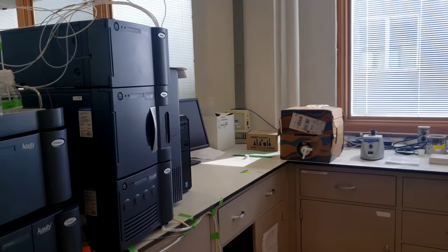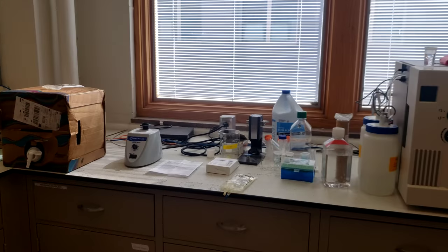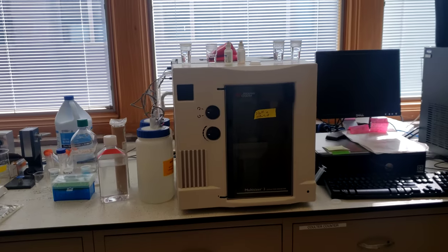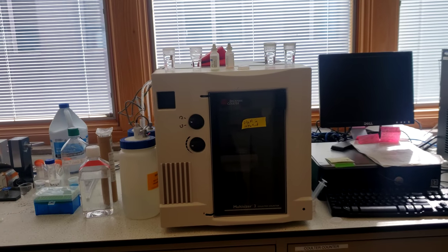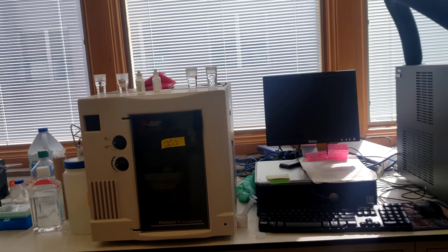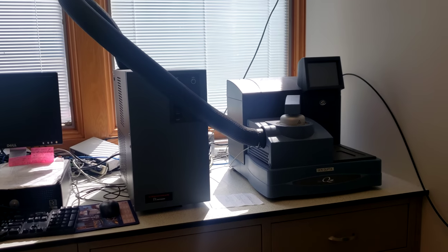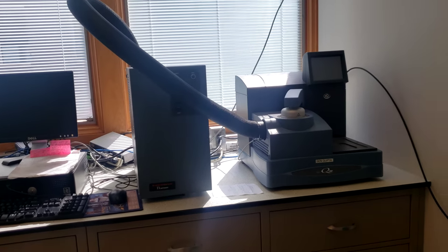Additionally, we have a UPLC for liquid chromatography, a Coulter counter that we use to count the platelets that are in the blood samples that we use, and a DSC or differential scanning calorimetry that measures how our materials change with temperature.